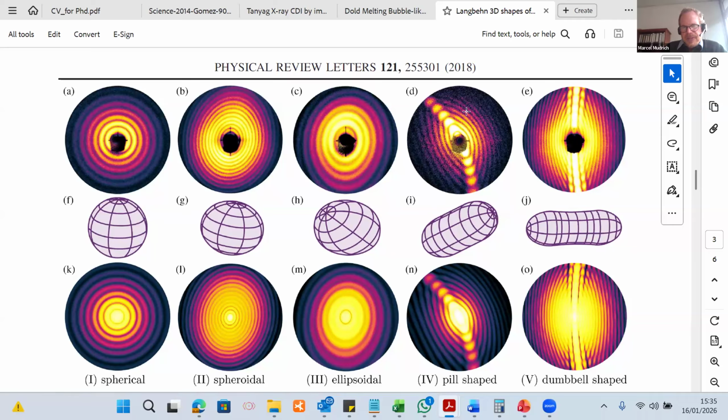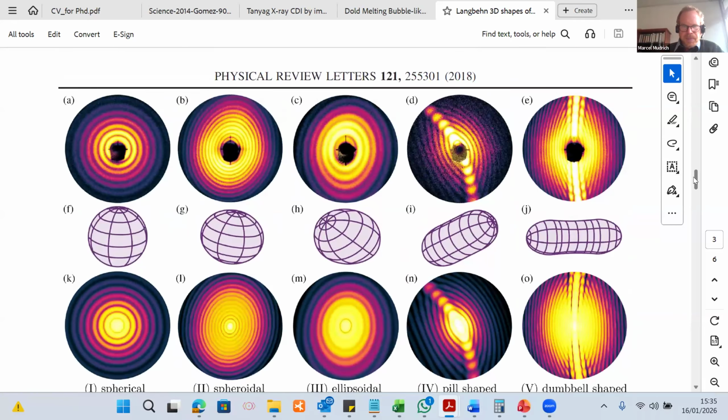And since here it was not only small angle scattering but wide angle scattering, this produces not only these linear streaks, but for specific orientations in wide angle scattering, you get even bent structures. That's actually better to reconstruct the full three-dimensional distribution than just small angle scattering, because from small angle scattering you essentially get only the 2D projection, whereas these images actually contain 3D information at wide angle scattering.